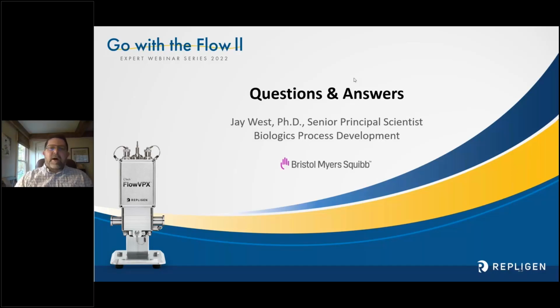So in the pilot lab, they're able to shave almost a whole day off the operation, because they've got their inline VPX. They get the reading, they know when to stop the process right away because it's very accurate typically. They take the sample, they walk it over to the solo VP just to confirm. Then once they know it, they do the recovery, and then they're good to go.